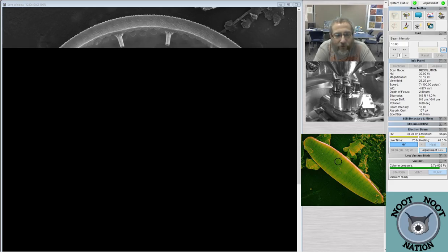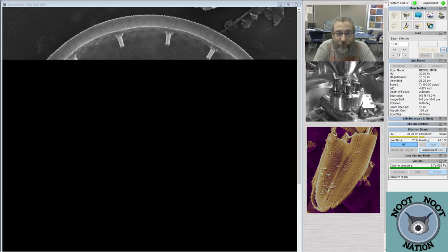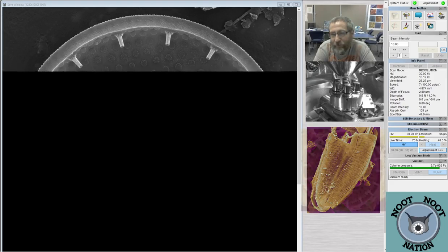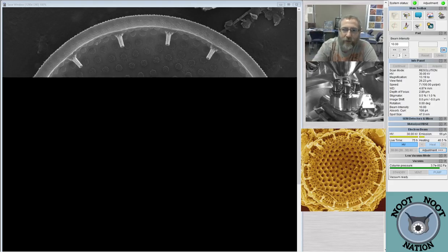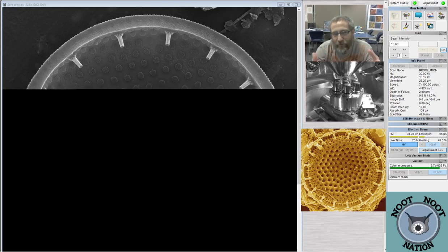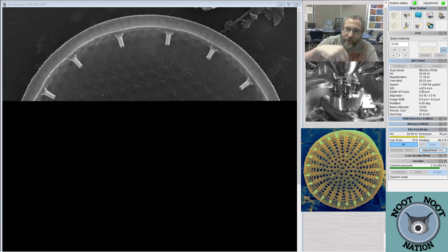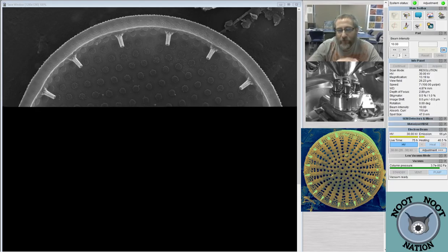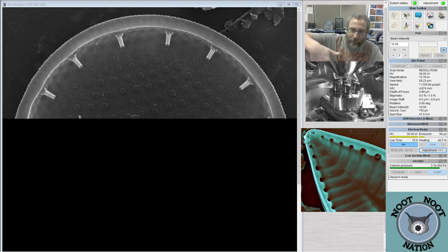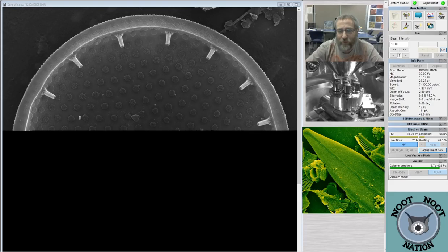And if I were taking pictures to try to characterize it for identifying it or something, I would do that. The problem is that I wouldn't be able to tilt it very far because you can see down below me, there's the inside of the chamber, and I have all 7 stubs mounted on a carousel. And if I tilt it, the SEM knows what's underneath the actual sensor, but it doesn't know what else is on the stage. So when I tilt it, I have to worry about the other samples bumping the sensor or the pole piece, which is the sort of cone-shaped thing coming down.